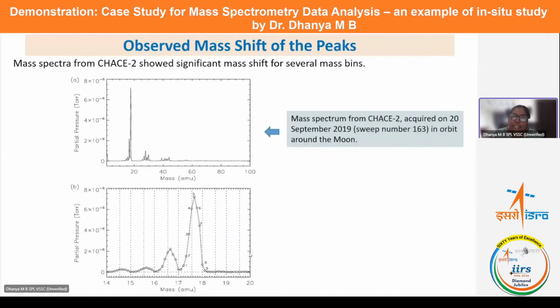Good quality data is something like this: out of the 9 samples, 4 samples should follow an increasing pattern, the 5th sample should be at the peak, and the remaining should show a fall off. This is a good quality peak, and the peak should appear at the expected mass position.